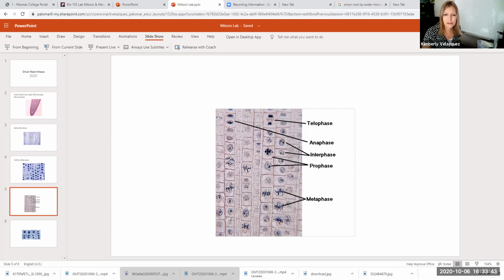Okay, again, prophase, starting to see chromosomes. Nuclear envelope is not round and nicely intact. Telophase, this is very early telophase. You're starting to see that cell plate form and you're starting to see the nuclear envelopes reforming. I like to say in anaphase, it's like this. In telophase, it's like this. Anaphase, telophase. Telophase, anaphase, telophase.